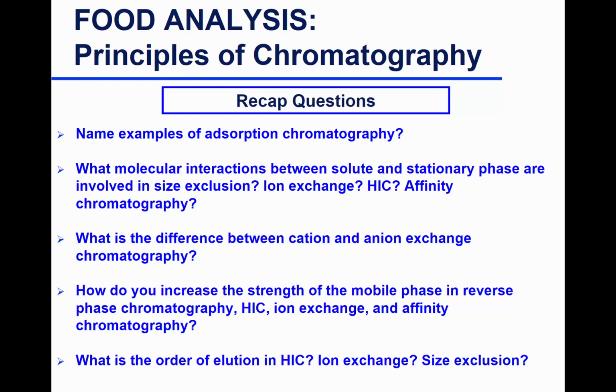In affinity chromatography, how do we increase the strength? There are two ways. There's a non-specific way and there's a specific way.